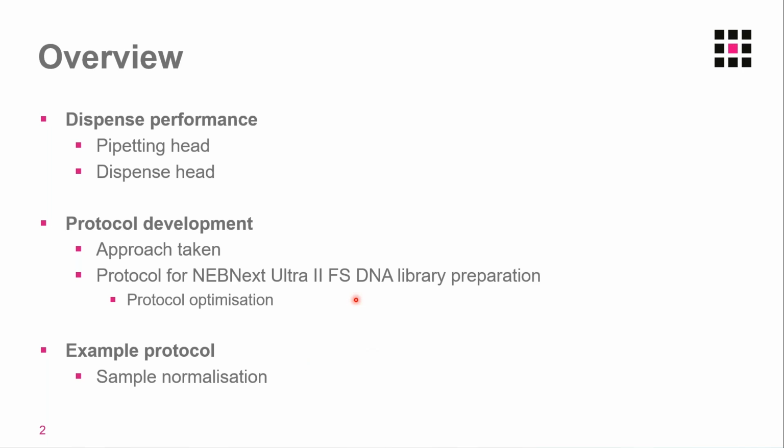So today I'm going to take you through some of the dispense performance data we've collected using Firefly. The main part of my talk will focus on the protocol development work we've been doing. And I'm going to share with you some of our initial run data. I'll finish up by taking you through a short example protocol to show you how we can actually normalize samples quite simply using Firefly.